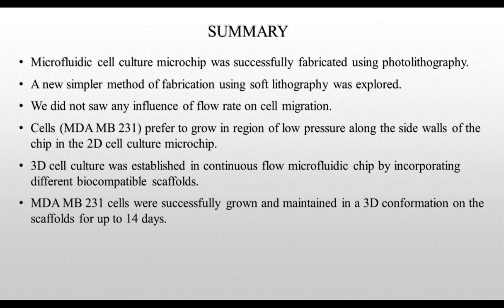So to summarize, a microfluidic cell culture microchip was successfully fabricated using photolithography. A simpler method for fabricating was explored using soft lithography. We did not see any influence of flow rate on cell migration. Cells preferred to grow in the region of low pressure along the side walls of the chip in the 2D microfluidic chip, and 3D cell culture was established in continuous flow by incorporating different biocompatible scaffolds. Lastly, we were successfully able to culture cells up to 14 days, which eventually turned out to be tumor cells.